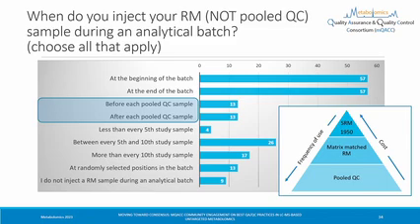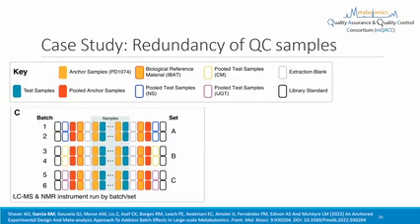And we think this is a great strategy to consider, and I'll highlight a case study right here. So this is a group from, I think it's mostly Georgia. I think Georgia Tech folks are in here too, doing C. elegans work, and they really stack their batches with quality control materials.